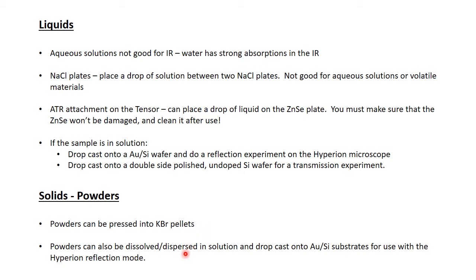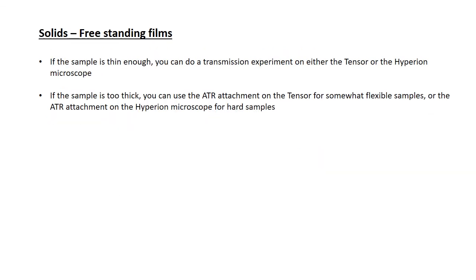Powders, again, can be dissolved or dispersed in solution and then drop cast, as we discussed above, to do those types of experiments. So if you have a solid that's either a freestanding film or just a bulk solid, there's a couple of things we can do.